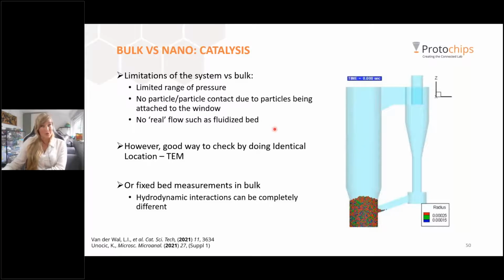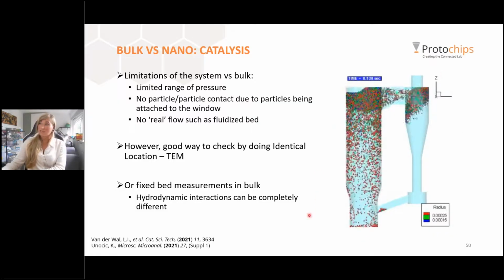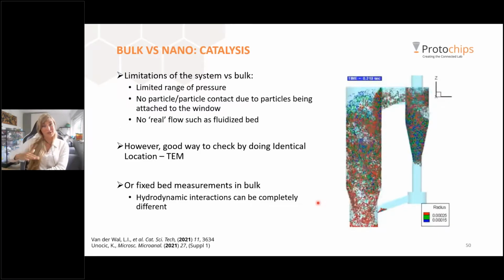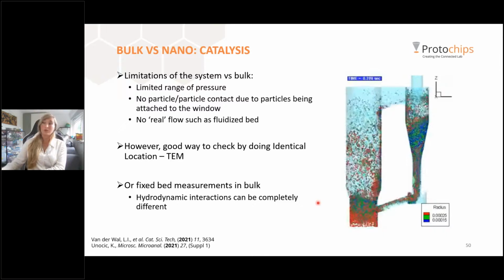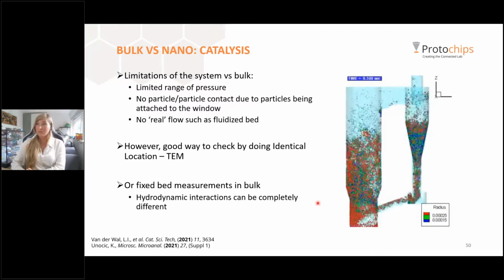There's also no particle-particle contact, because mostly your particles are attached to this E-chip. So we don't have the same type of reaction that we had, for instance, for a fluidized bed or any type of catalyst reaction in a reactor. This is what a normal catalyst reactor in a fluidized bed would look like, for instance. But now we have our sample on the E-chip and the flow going over the sample, which will cause different kinds of reactions.